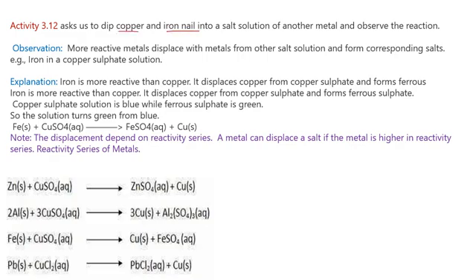Activity 3.12, we are asked to dip a copper and iron nail into a salt solution of another metal and observe the reaction. Okay, this is quite a familiar activity. You have been doing this activity since your junior classes also. So let's see what the reaction is, how it takes place.